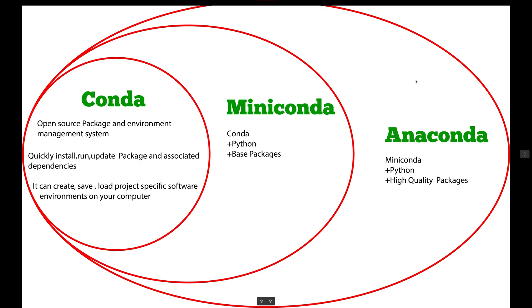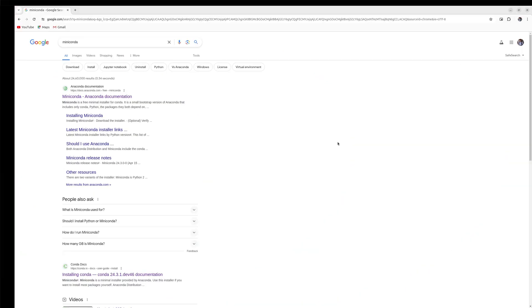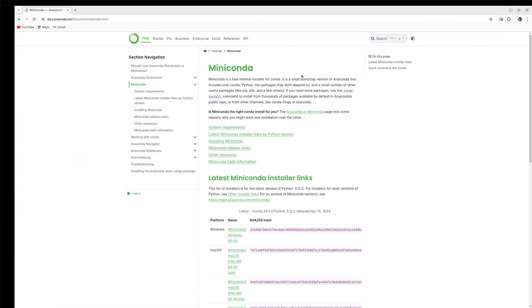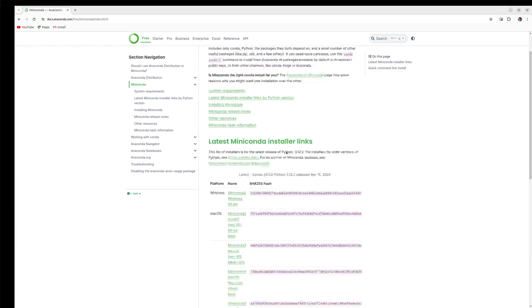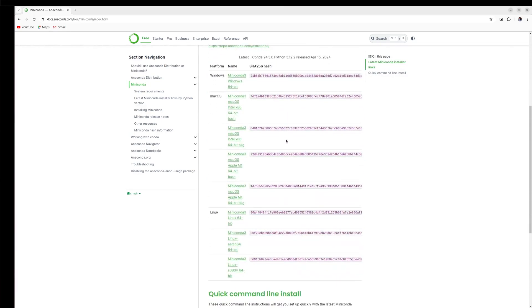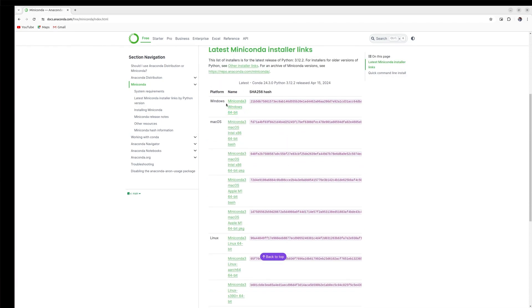These are similar tools, so you don't need to confuse about Conda, Miniconda, and Anaconda. I am going to show you how you can install Miniconda in your Linux system as well as Windows and Mac. To install Miniconda, you can search for Miniconda on Google and open the Anaconda documentation, which has all the details. You can download the software from there for Windows, Mac, and Linux.